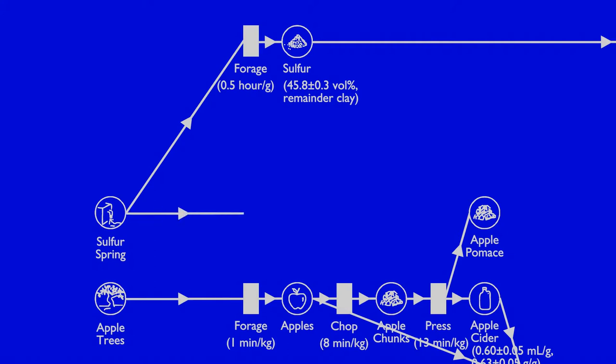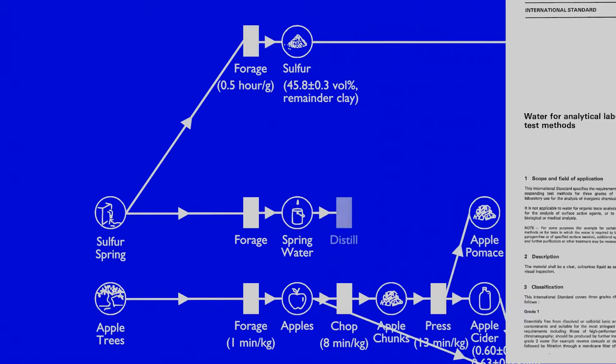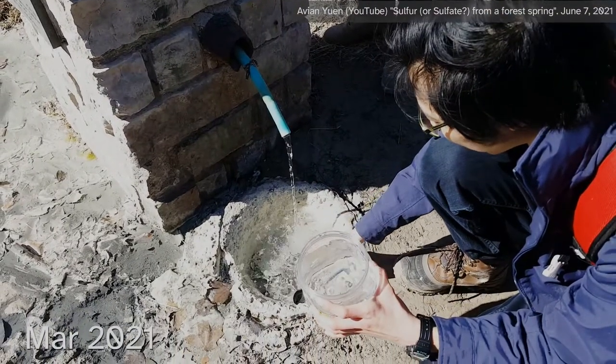My goal is to do a single stage distillation to get ISO 3696 grade 3 water, which will be good enough for basic analytical work. For this project, I'm using the sulfur spring I found last time. As we saw in a previous video, it will also contain the salt I'll need for future steps.